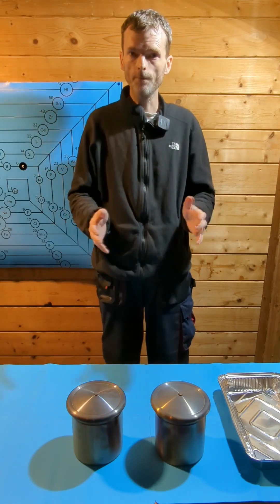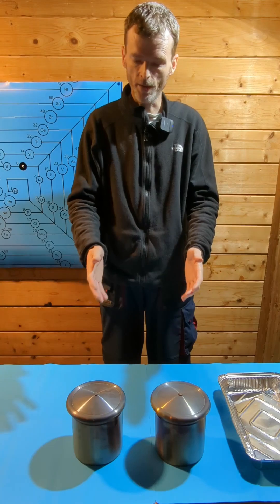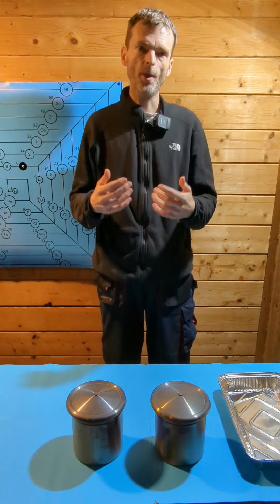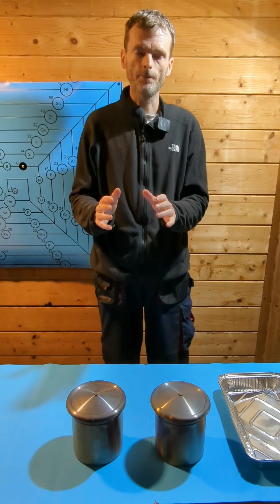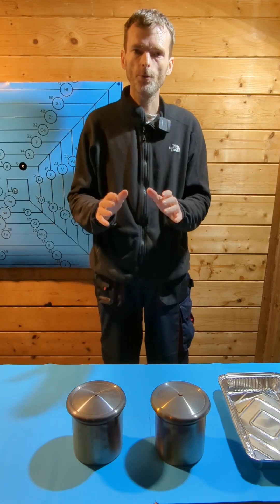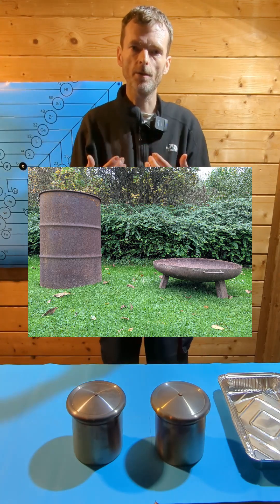Pyrolysis only works in the absence of air, which is why I have put lids on the crucibles. The crucibles have cooled down. Before we get to the fun part and see if we actually have biochar in there, I need to give a word of warning: never produce biochar inside a building. The pyrolysis process releases harmful fumes that need to be vented. So please always produce biochar outdoors and use, for example, a drum or a bowl-shaped kiln for this.